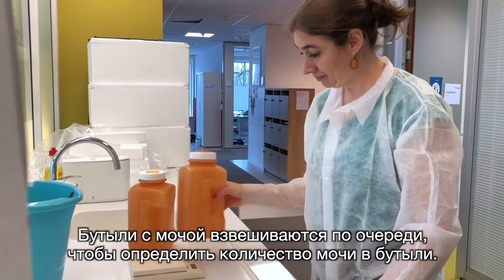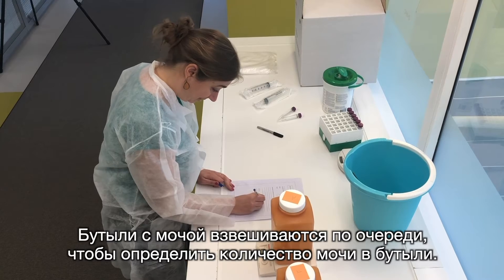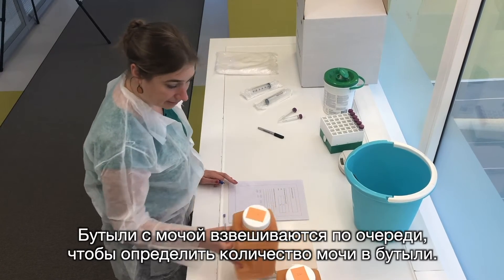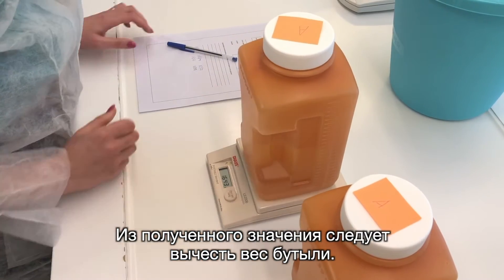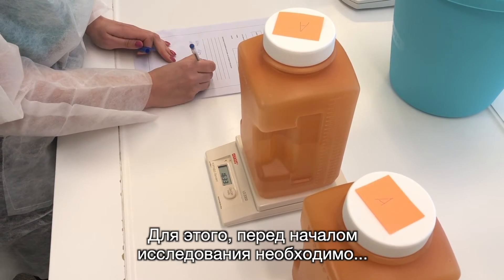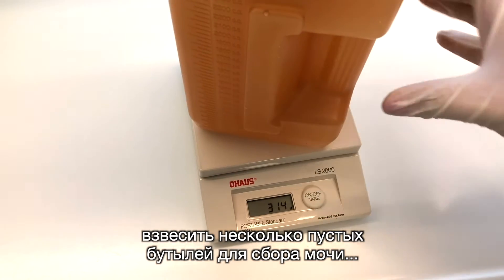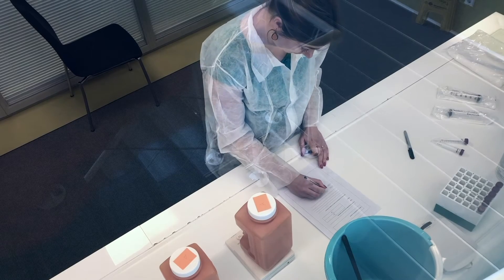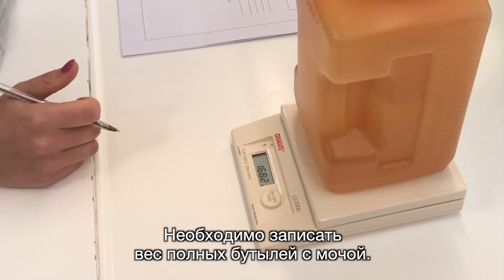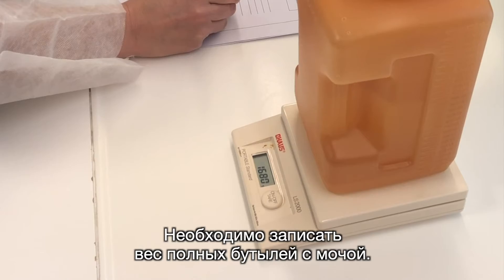The urine bottles are weighed one by one to determine the amount of urine in the bottle. The weight of the bottle should be deducted from this weight. It is therefore necessary to weigh some empty urine collection bottles and record this weight before starting the research. The weights of the full urine bottles must be recorded.